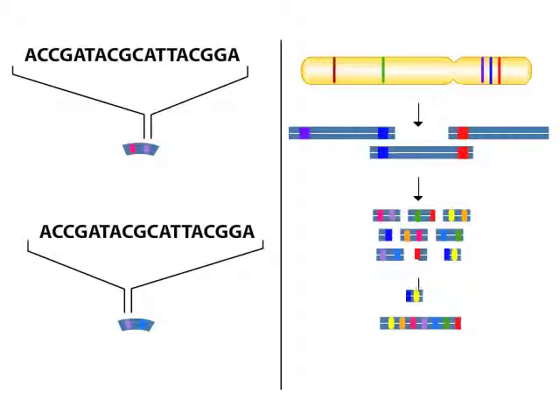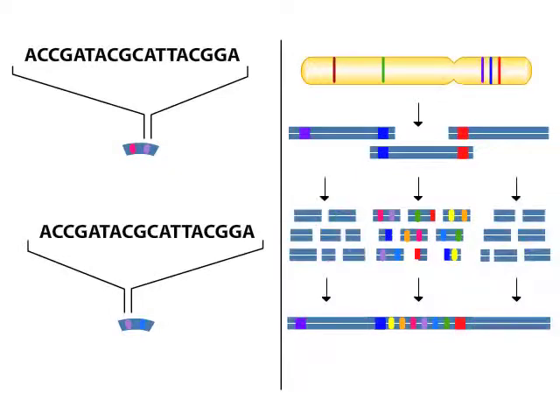Computers store the sequence data and, using computer algorithms, compare the data for overlapping sequences. These common sequences allow the computer to merge information from more than one fragment into one long DNA sequence. Each overlapping large fragment is analyzed until the entire genome sequence is determined.